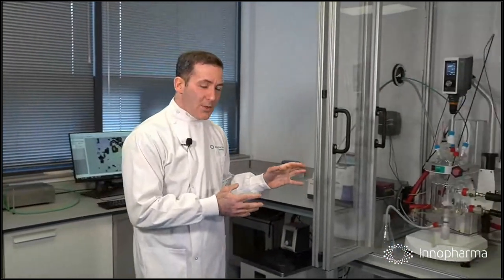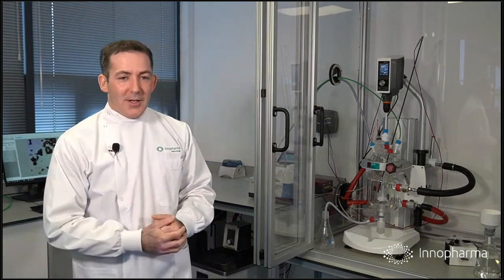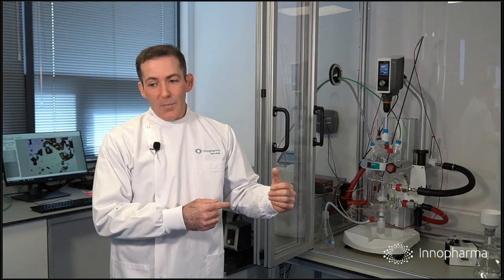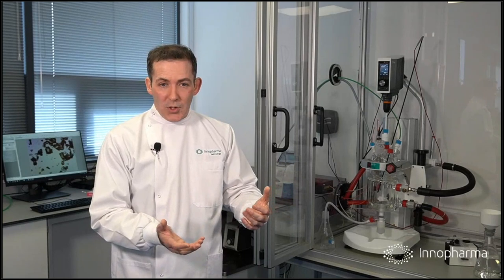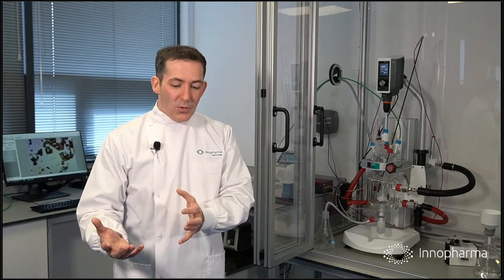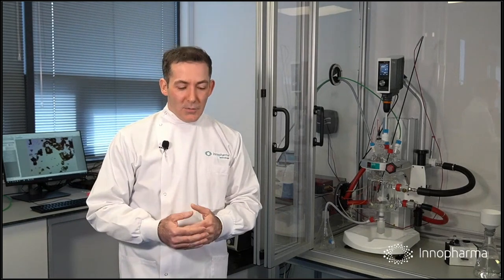So you've seen how we've taken the sensor data. We looked into our reaction, and we took that sensor data and made sense of it using chemometrics. Part of that journey involved comparing the sensor signal over time, in the case of principal component analysis, and comparing that to how we know our concentration is changing. We also discussed how you can compare the signal to a reference method using, for example, partial least squares regression.